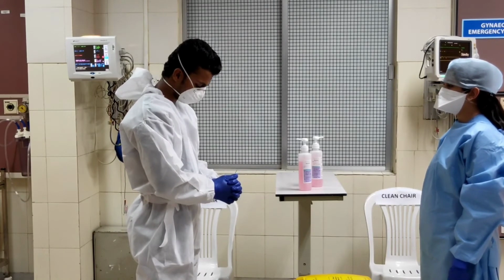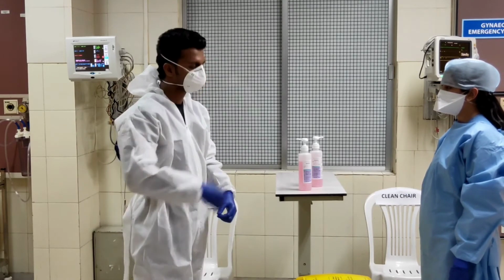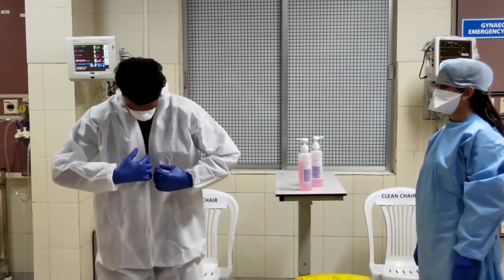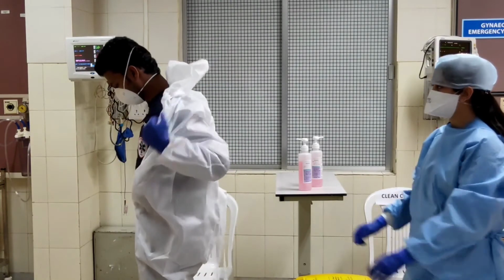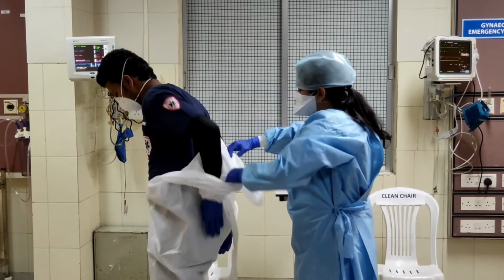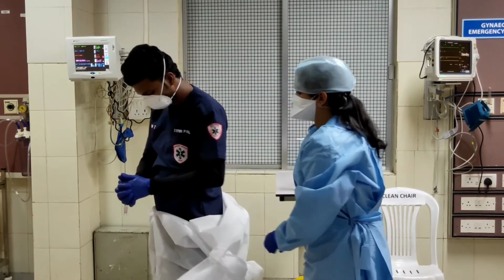Now you can remove the PPE gown. For removing, first remove the tie securing the PPE. Now pull the zipper all the way down and slowly remove the gown by pulling it apart from the mid position without touching the outer aspect through the inner aspect. At this point, your spotter can help you remove the gown by pulling it downwards while you pull your arms out, turning the PPE inside out.